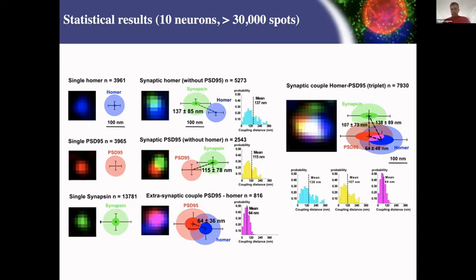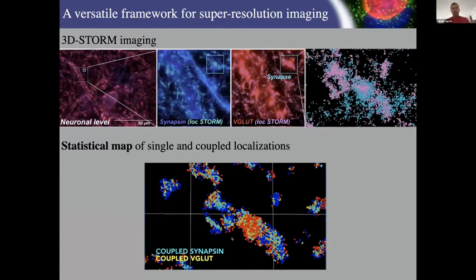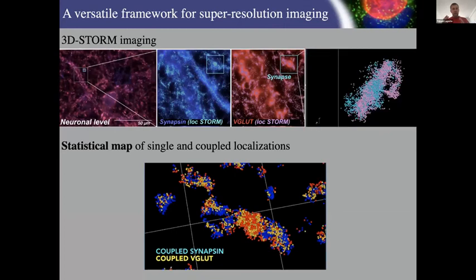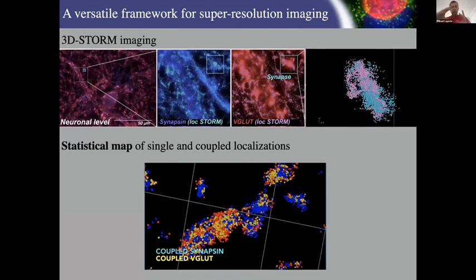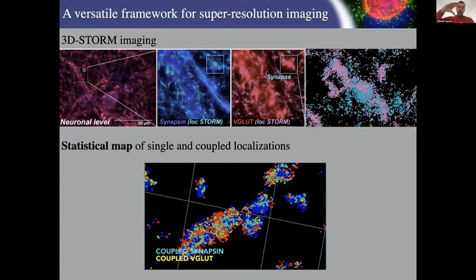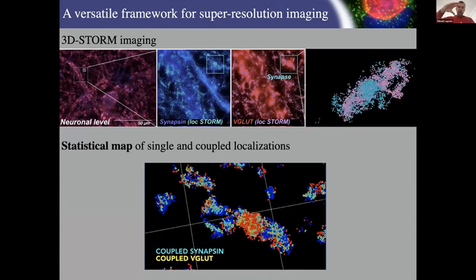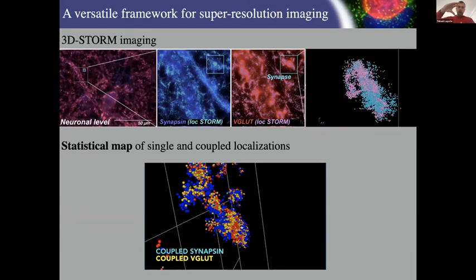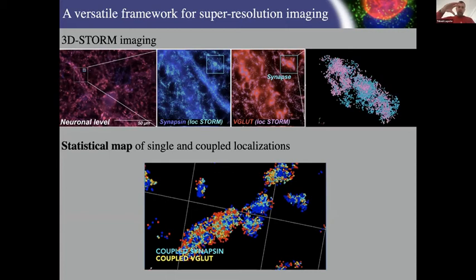And I don't remember, but yes. And the next slide is that actually what I showed with structured illumination and spots, etc., is completely also applicable to single localizations. So you have to segment a region of interest. So this is something that we do. We segment the presynaptic bouton by looking at the cluster, and actually we use DBSCAN. And inside the presynaptic clusters, we look at the coupling between single molecule localizations at different distances. And we extract molecules that were single or coupled.